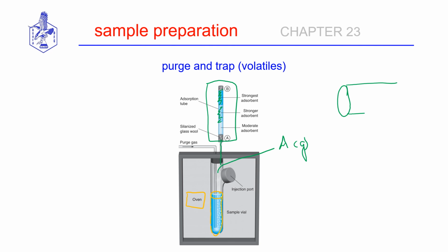place it into a temperature control. So put the tube in here. Your analyte species is all pre-concentrated into that tube. If you heat this and let that go into your column, okay, we have pre-concentrated our volatile components and can detect them at low concentrations.